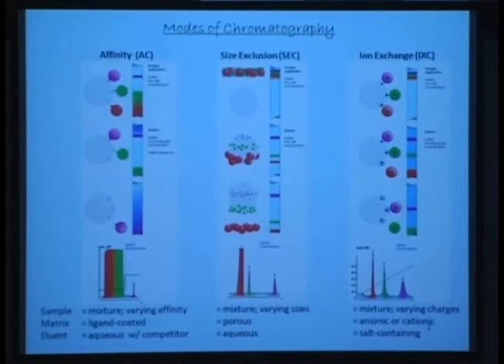You still lose 5 to 10% of the sample, followed by what do you do to collect glycans in general, isolation? These glycans are in water. So how do you remove water? Lyophilization.